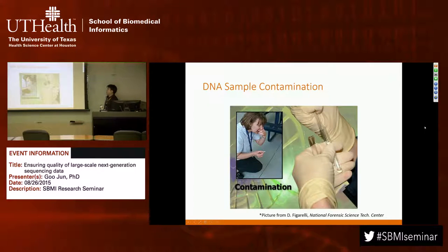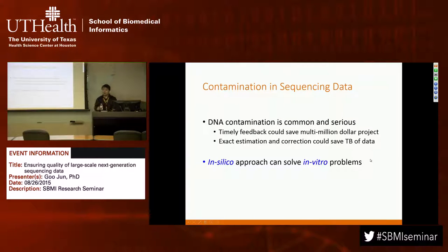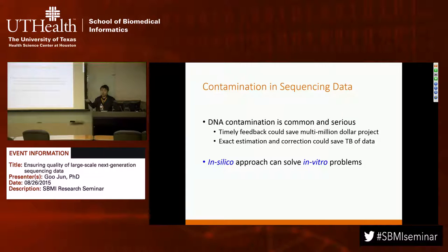DNA sample contamination is a very common problem. Certainly in a lab environment it's more common than you might think, and it's a very serious problem because it usually happens in batches. When it happens in batches it's worse. When there is a protocol change and they don't know there was a problem in their protocol, it can affect many samples. Exact estimation and correction could save terabytes and sometimes petabytes of data. We developed an in silico approach that solves this in vitro problem.